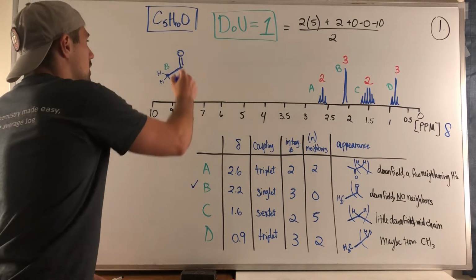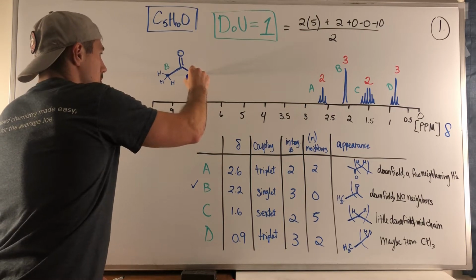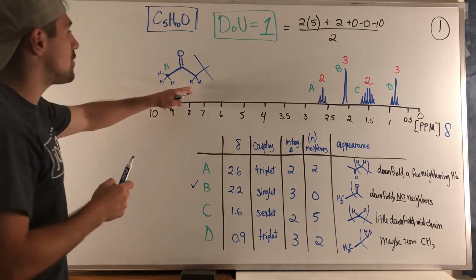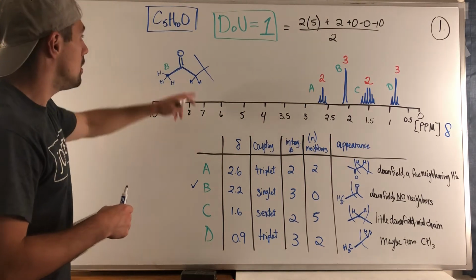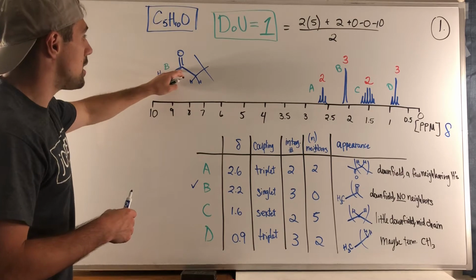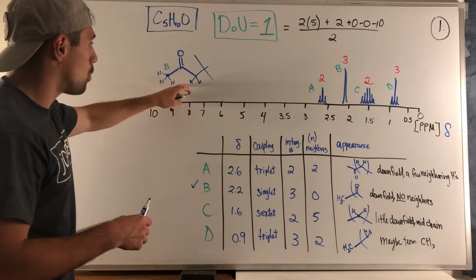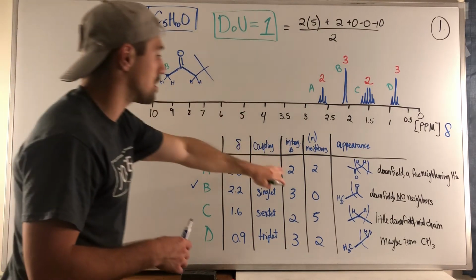Okay? So then let me just draw another carbon. And let me just assume that my chain is going to go on. Let me just kind of cut it right here. Let me see if I can explain this. So this would maybe correspond to peak A, right? 2 hydrogens here. So no neighboring hydrogens next door, but this would cause it to be downfield, right? So to make this work, everything's looking good because there's 2 hydrogens, which corresponds with our integration number.